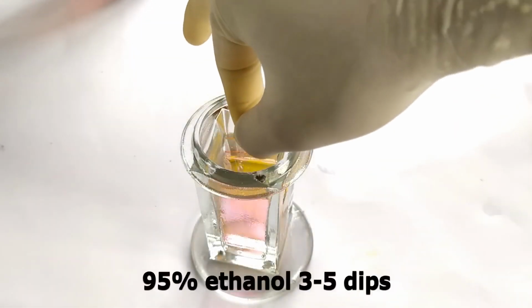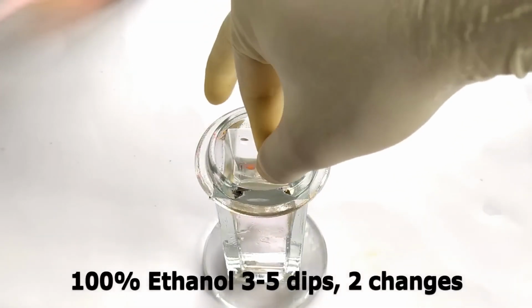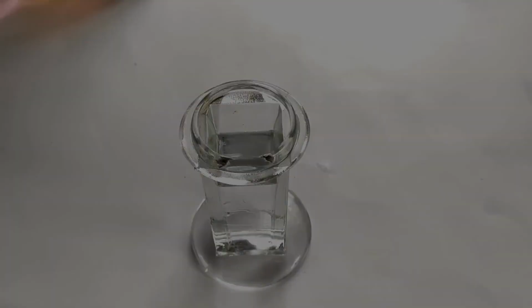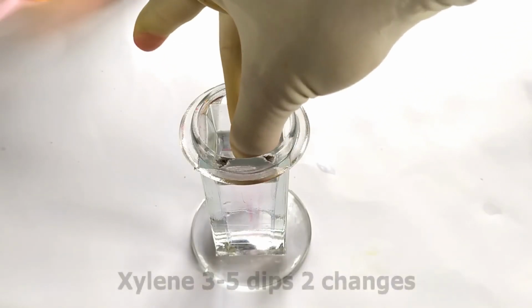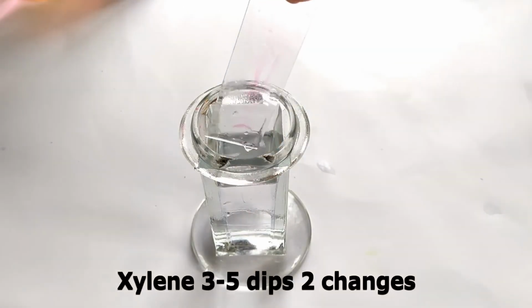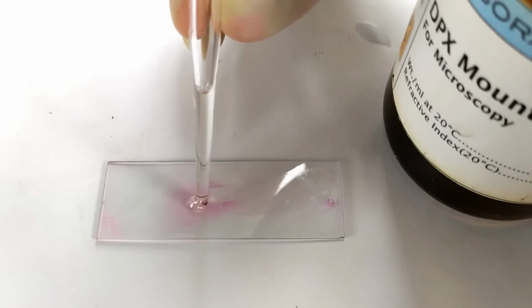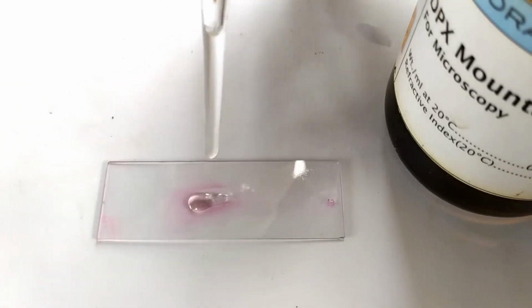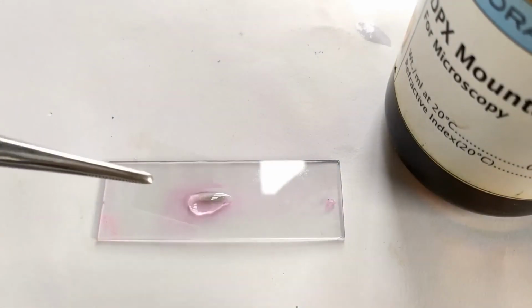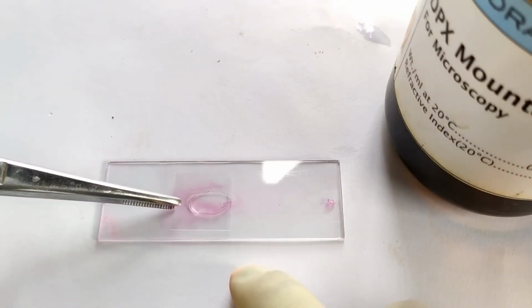Give the slide 3 to 5 dips in 95% ethanol, followed by another 3 to 5 dips in absolute ethanol with 2 changes, which is then followed by 3 to 5 dips in xylene with 2 changes. Add a drop of mounting medium such as DPX or Canada balsam to the dehydrated and cleared smear. Cover it with cover slip. Allow the slide to air dry overnight and observe under oil immersion objective of the microscope.